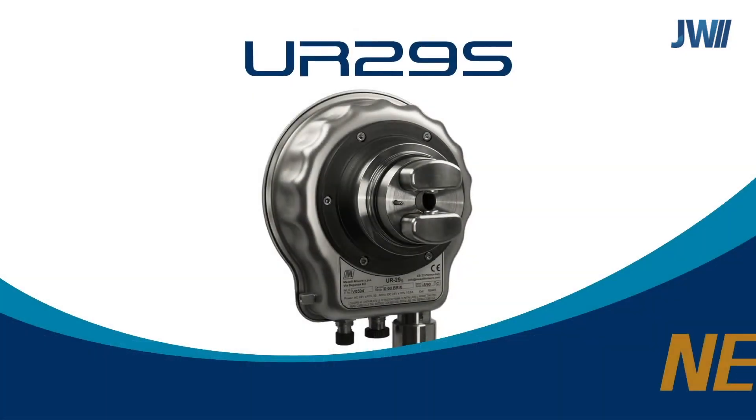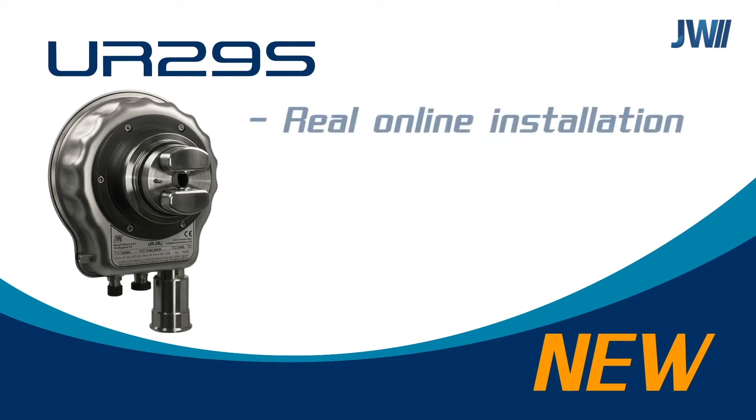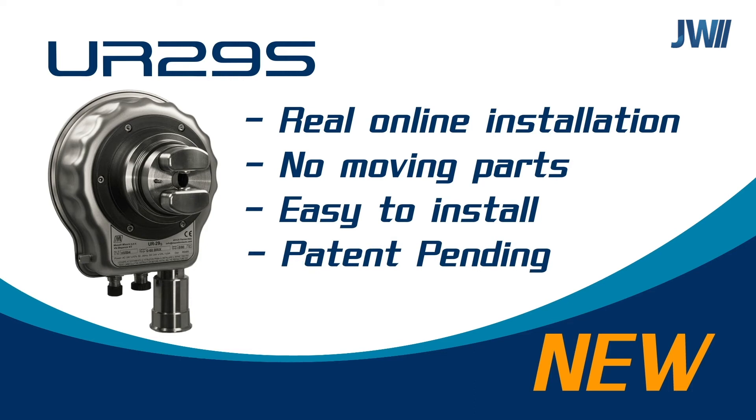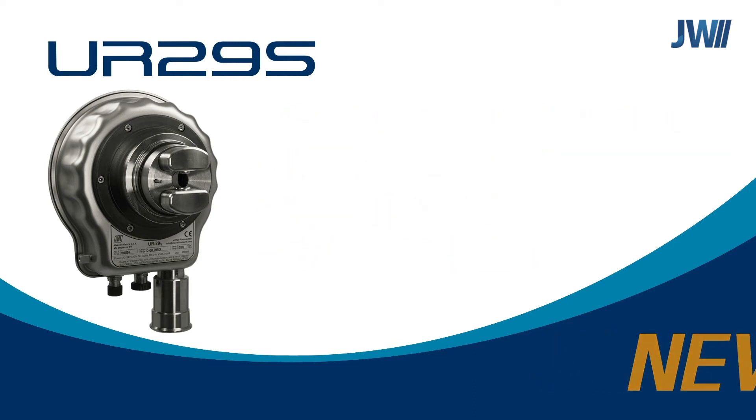The UR29S is a combination of two technologies: a refractometer plus sound velocity meter. This solid-state device can be used for more complex analysis, such as alcohol or sugar inversion measurements.